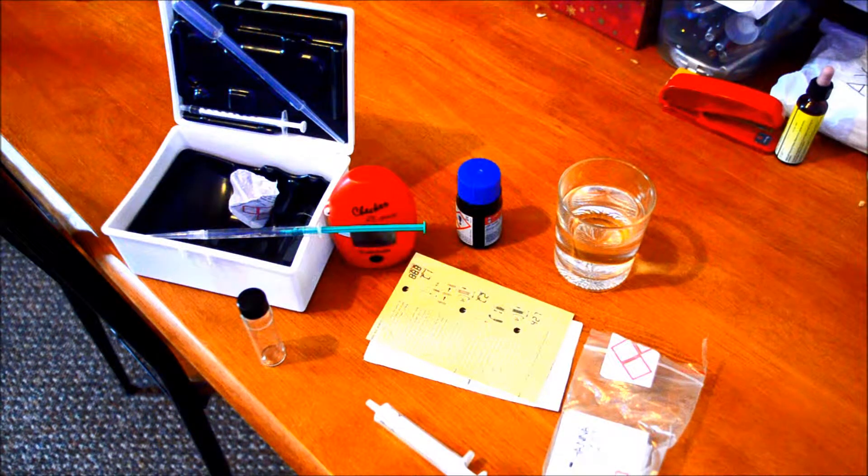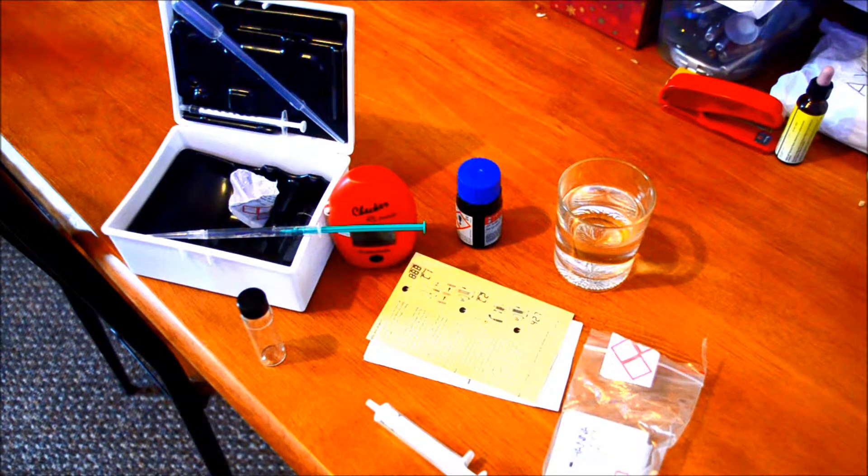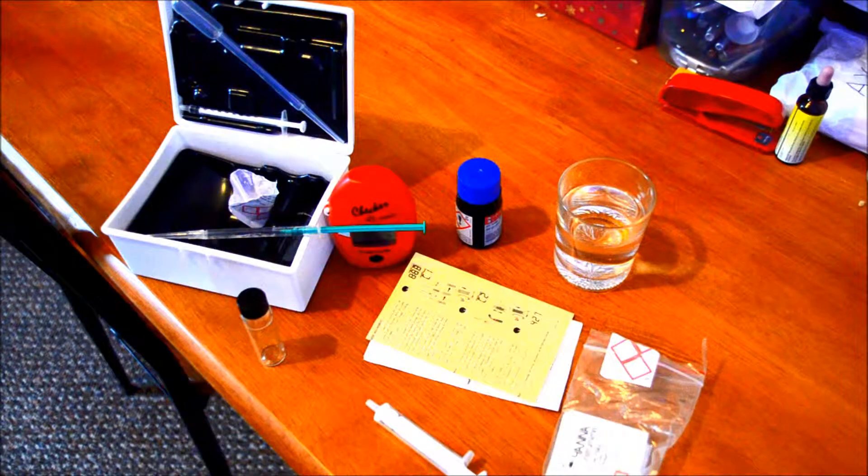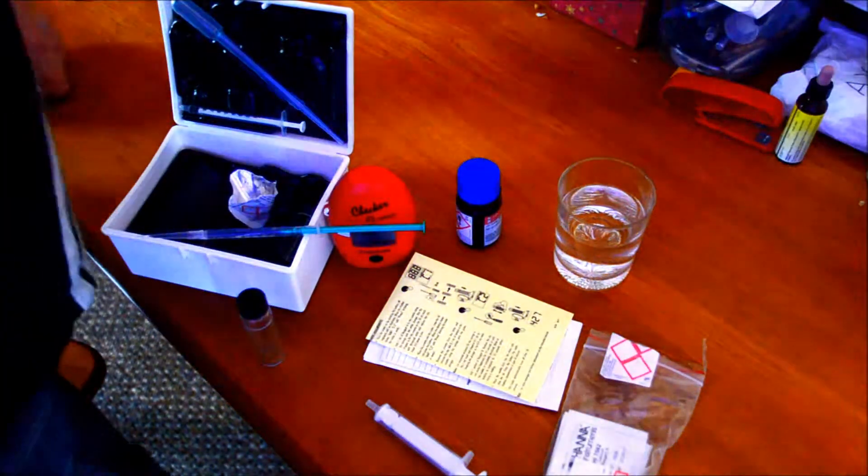Alright YouTubers, here I'm going to do another video of another piece of equipment I bought. It's the calcium Hannah checker and I'm going to do it in front of you, so if the readings are wrong, it's my problem.